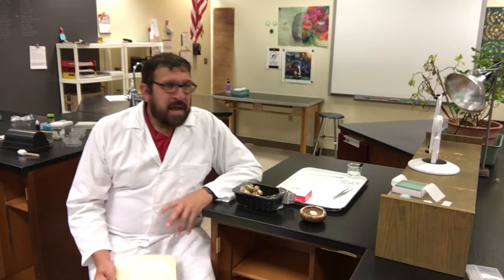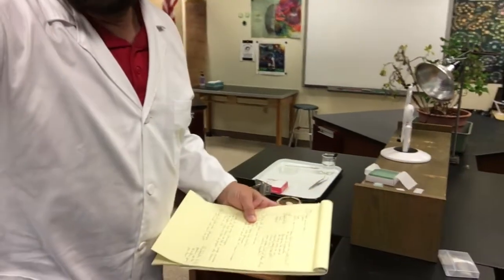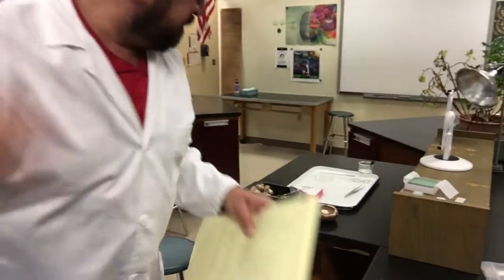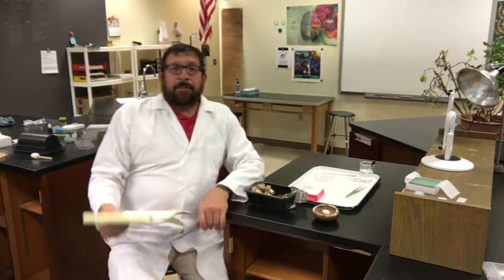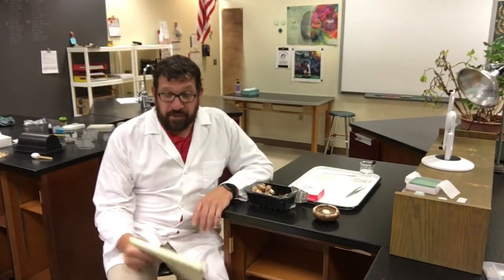The main thing I want to do is I want you to get a good look inside of a mushroom, and let's use our equipment. I've got the stereoscopes and the microscopes set up so that we can look at these different parts, get a real in-depth, close look at the things that our eyes just can't see normally. And I'm going to take some pictures and show you those.